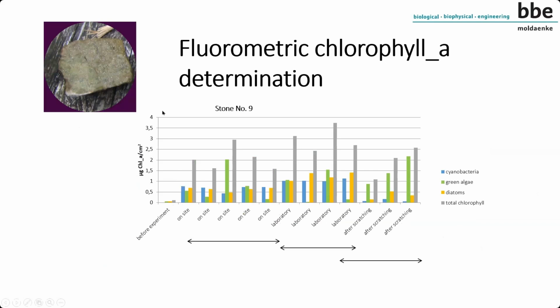Therefore we think it's important to take a lot of samples, for example with a BenthoTorch or with a fluorometric device, to determine the mean value of biofilm Microphytobenthos on the sample. That should clearly show that there are advantages to taking more samples with a fluorometric approach, to see the difference between the different situations.